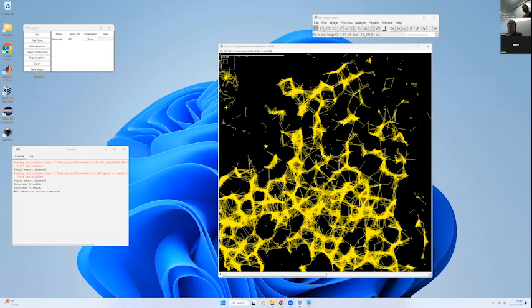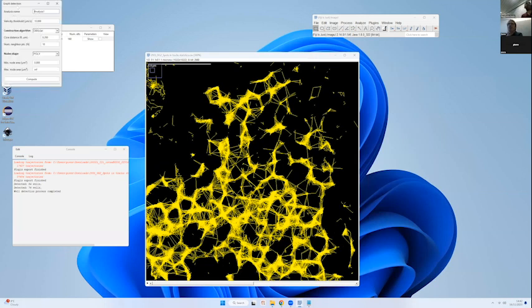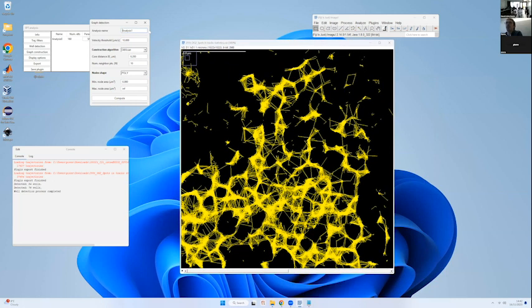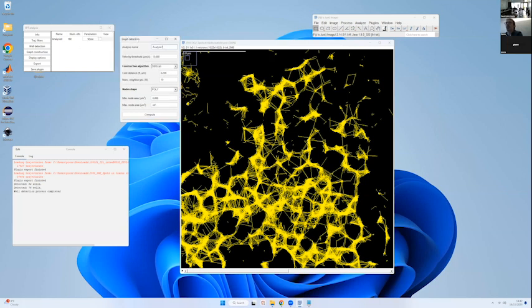Okay, cool. So last menu, graph reconstruction, graph construction. As before, you have the name of the analysis, so it will also appear in the main menu. Now, basically, for the reconstruction, you have 4 main parameters. The first one is your velocity threshold for determining what are low velocity regions versus high velocity regions. And the other parameters are related to the scan, and the last parameter is related to the shape of the node, so either polygon or ellipse.